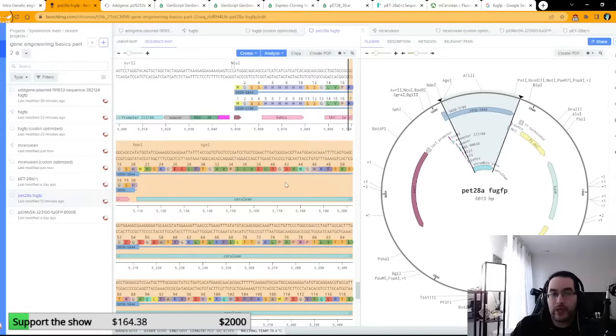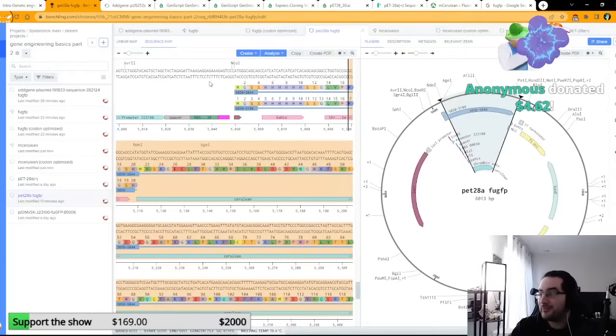So if you can understand these basic fundamentals, then you can watch the Whose Gene Is It Anyway streams, which I'm hoping to do more of, and understand what it is that I'm doing. It's just this, but more of it. Maybe there are more complicated things, maybe I'm having to futz with more complex promoters or interactions or whatever. But at the end of the day, it's all just this, and then you order the DNA, and then you test it. So yeah, that's pretty much the basics.